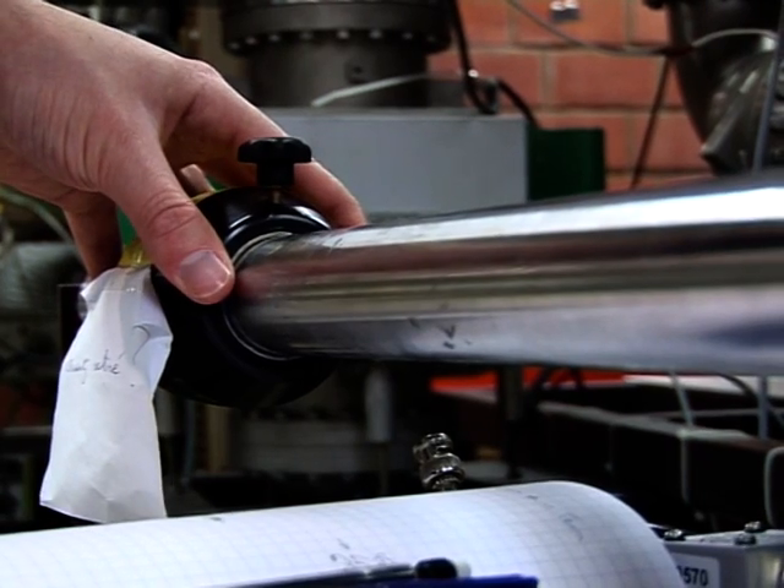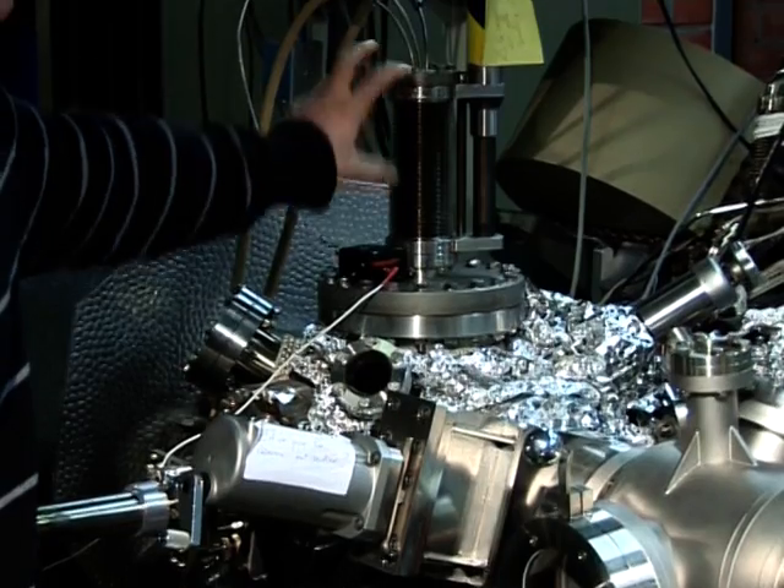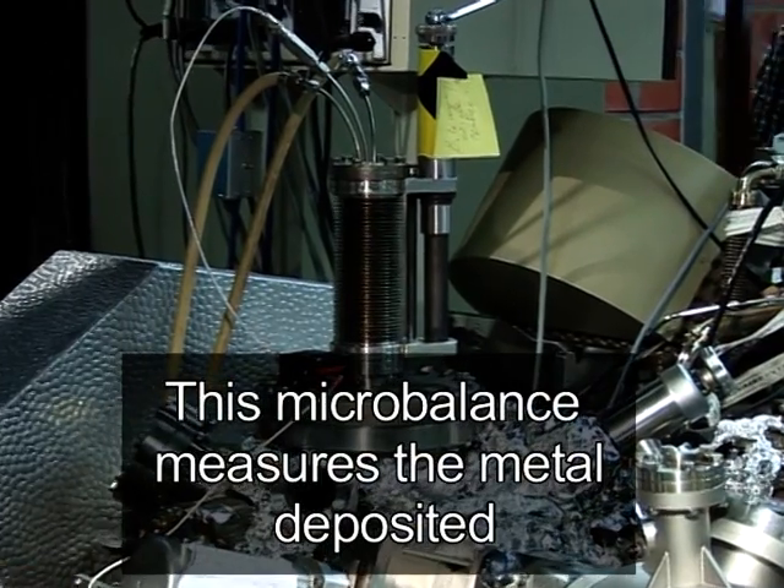Here I move the sample inside the chamber. And for the gas sensor, we really need to know which amount we evaporate and to go to very small quantities. So this is to calibrate the amount of metals that we evaporate on the sample.